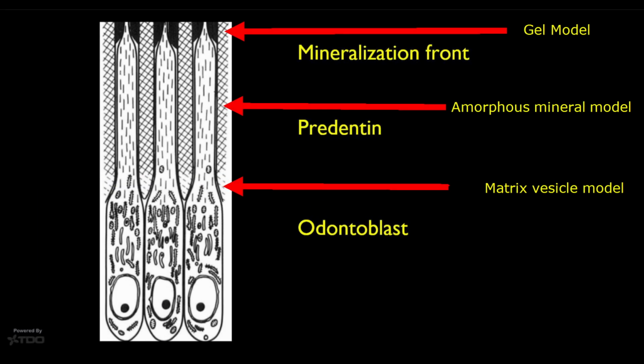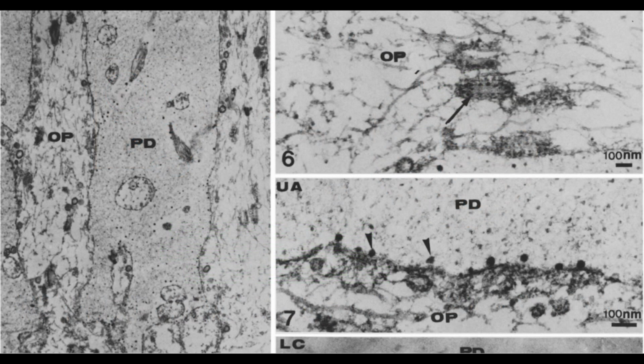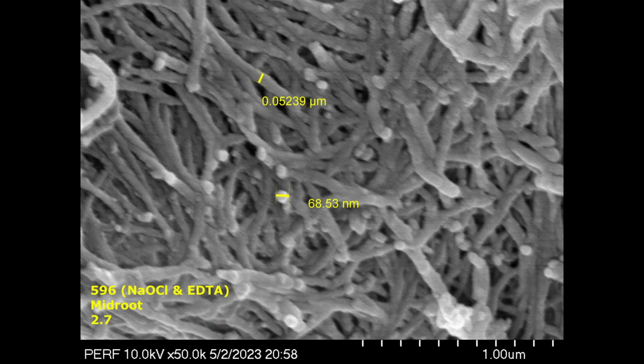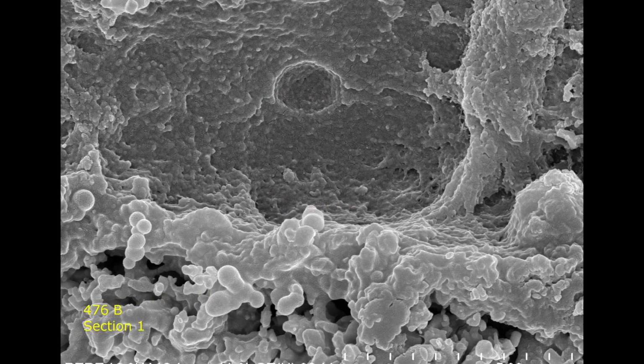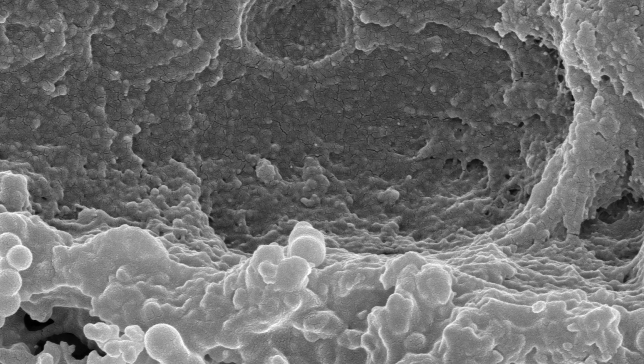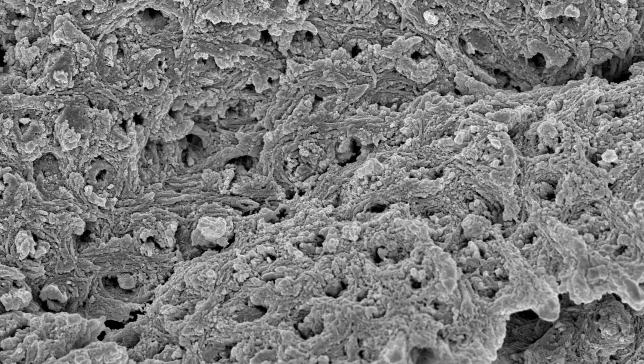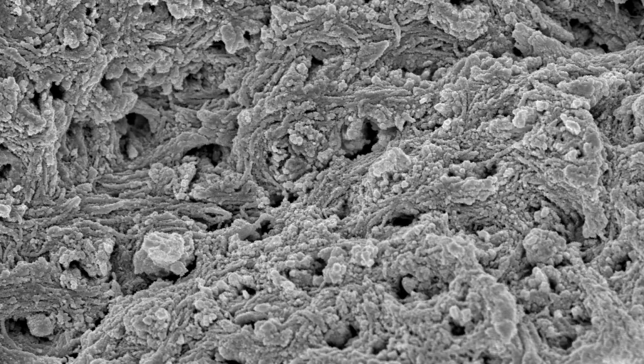I'll try to combine pictorial representations with some recent scientific advances and relate those things to the actual SEM clinical work we are doing at PERF. When you look at SEM images of dentin and pulp, you are confronted with an overwhelming array of confusing images and patterns that can be very puzzling, if not disconcerting.